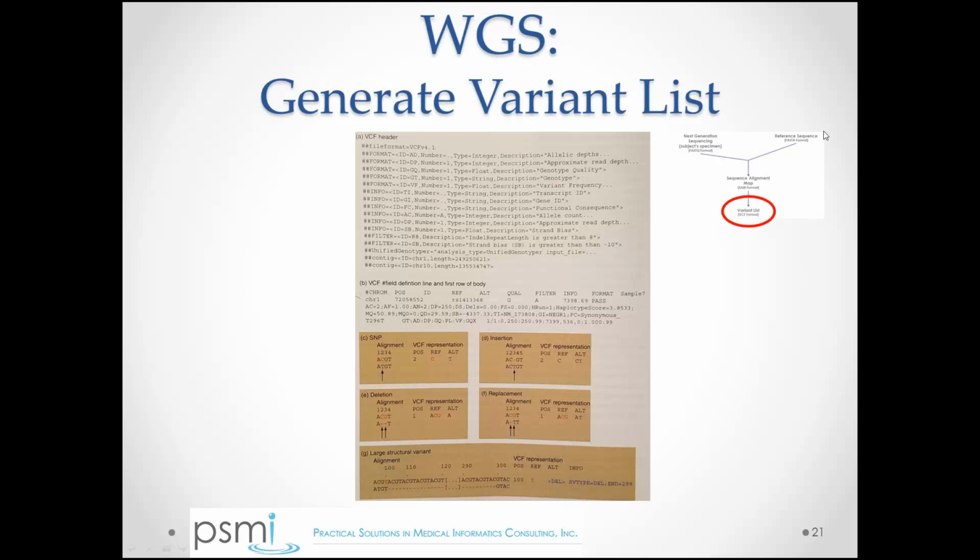And I think the last reference sequence that was published by NCBI is now 3 or 4 years old. And they have several reference sequences prior to that. And in some sense, what's more important is knowing what the reference sequence is, because the VCF files will always reference it.